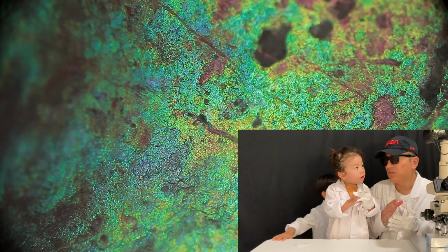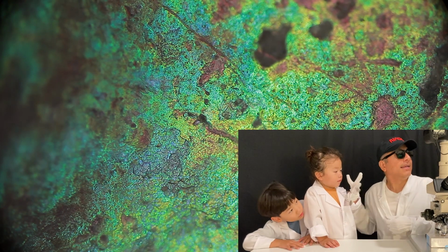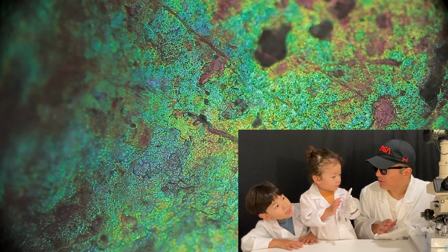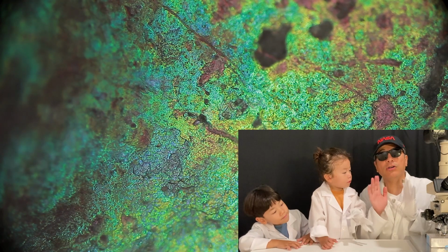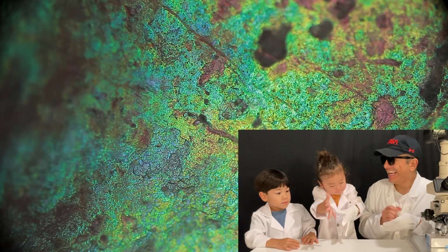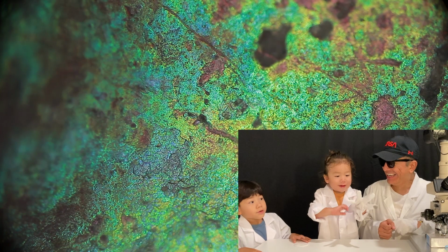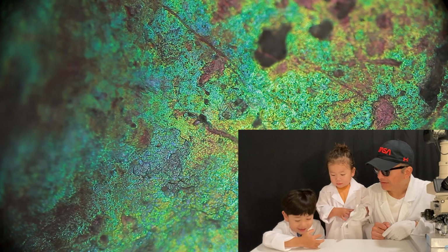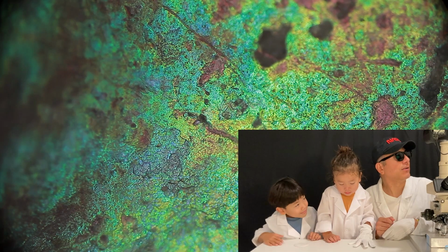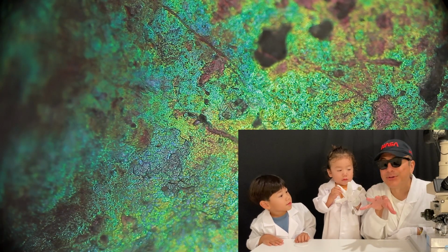And then what about those lines there? What do you think those are? Those are part of his shell. And he used to live inside his shell. But he's been long gone. He swims in the water like that. They kind of move a little slowly. Yeah, they do swim very slowly in the water. So there's the 10x. Hey guys, should we go deeper and closer?